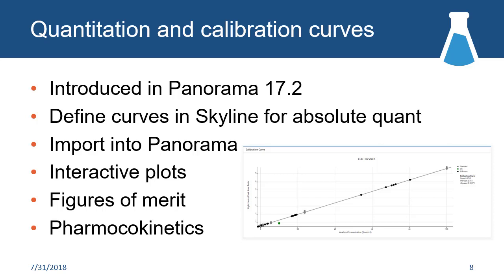And then we're also doing a variety of time-based support for reporting on these. So pharmacokinetics, and I think we're going to be doing pharmacodynamics very shortly as well, where essentially what you've done in Skyline is set up multiple replicates representing your different time points, and then Panorama will go ahead and plot those for you and do all the standard PK calculations and allow you to interact with what your initial and terminal, the C0 and terminal time points, are for those calculations.